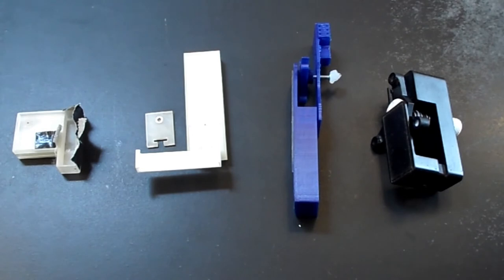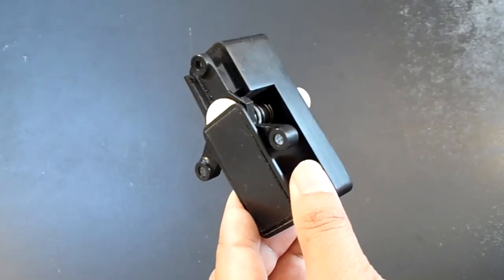But basically I really wanted to try to improve it as much as possible because I was using these microscopes at each and every step. And even as polished as it is, we're still working on making improvements.